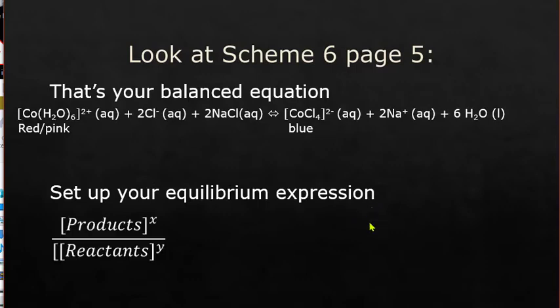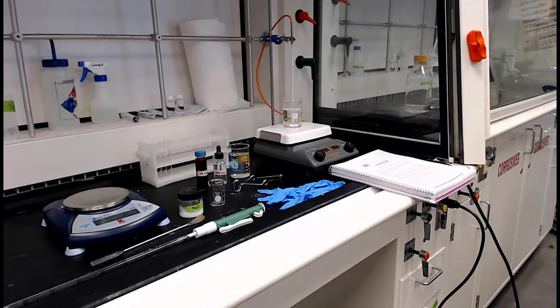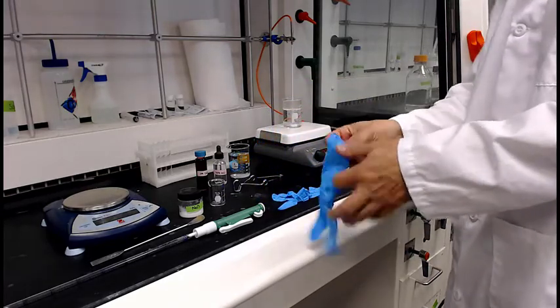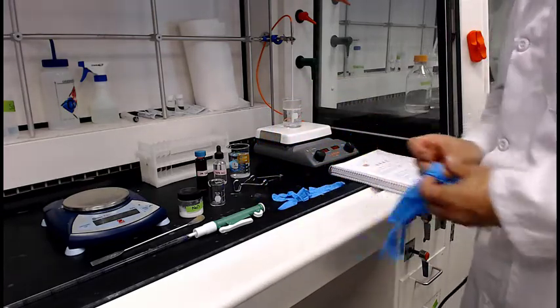And the technician will come in and help us with the chemistry. All right, for this particular reaction, we're going to need some hot. So we have a hot bath going over there on the right with thermocouple control. Remember the order in which you set those sorts of things up. Technician's on his game today. He's putting his gloves on first.